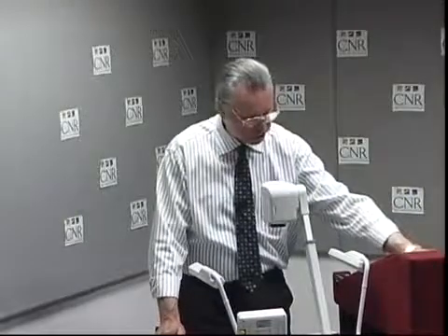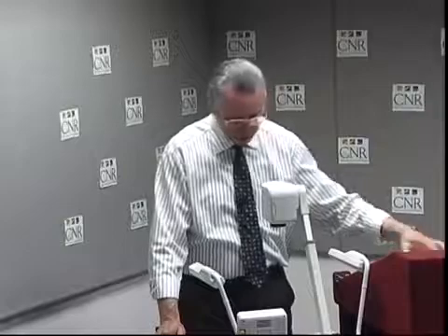And the fact is that we don't use this card in the calibration of the device, but in the original standard it was specified and issued but is not used. The dark dots that you see here are used.